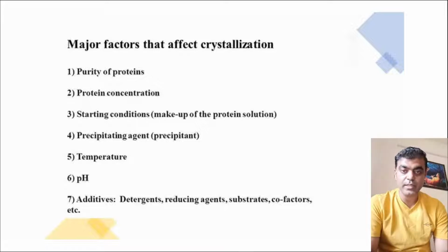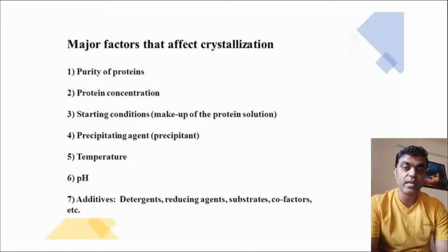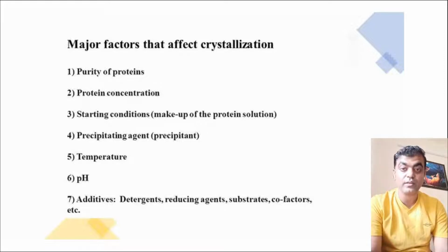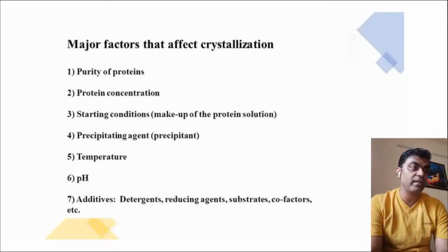pH, yes, the pH also has to be maintained, because if there are any isotonic solutions, the solvent and the solution will have that difference, so pH will determine the rate of evaporation, again based on the isotonic solution and surface tension. So those things will also be playing a role. And last but not least, the additives which you are using, the cofactors, the detergents, those things also have to be taken care of.